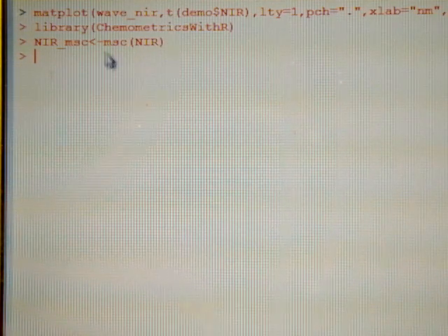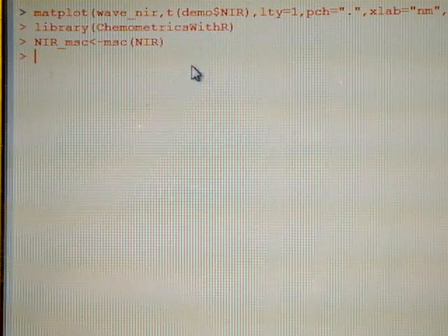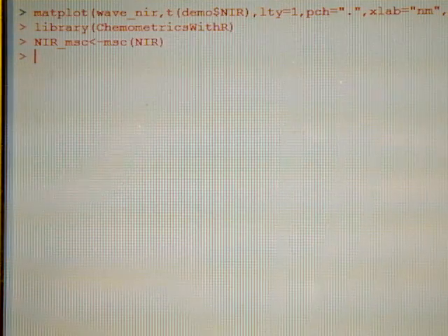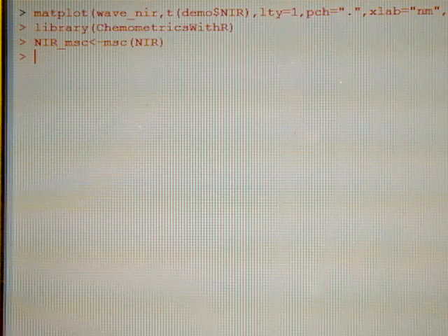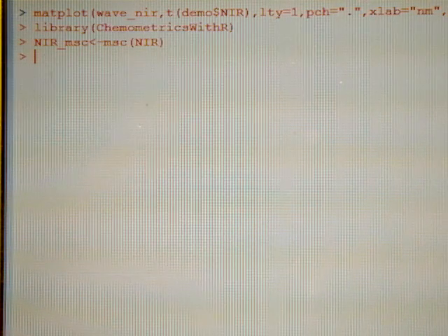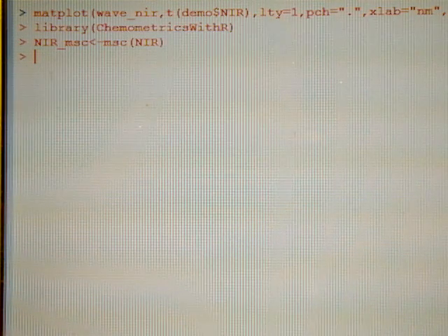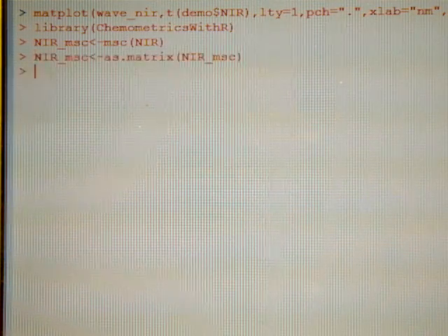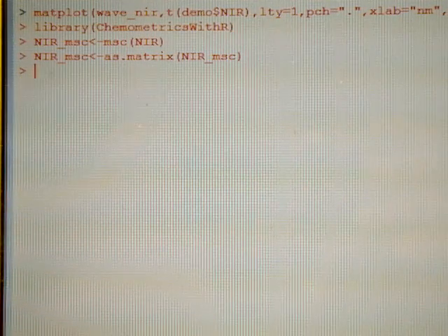So it is already, we don't get any errors, it is already done. Next is to define the NIR MSC as a matrix. It is already defined.